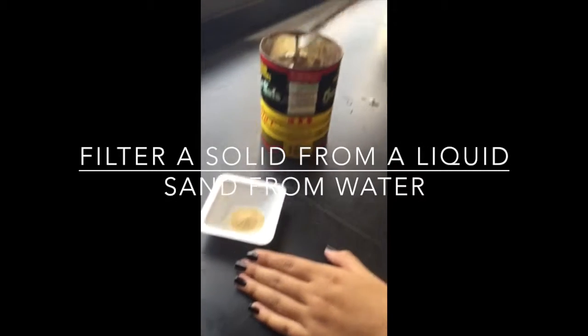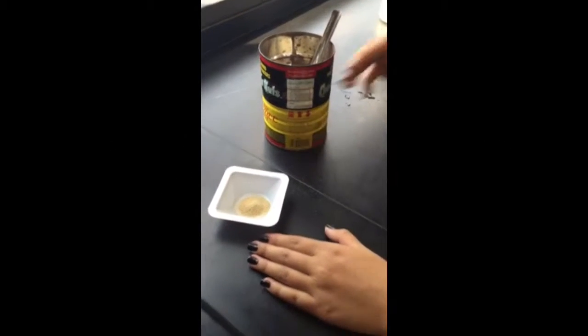To filter a solid from a liquid, I'm going to begin with pouring out a portion of sand onto a weight tray.